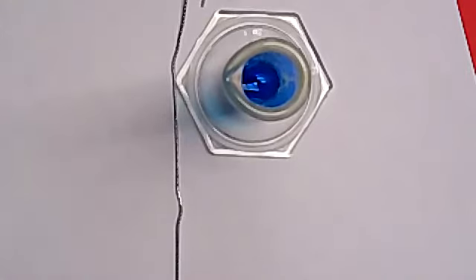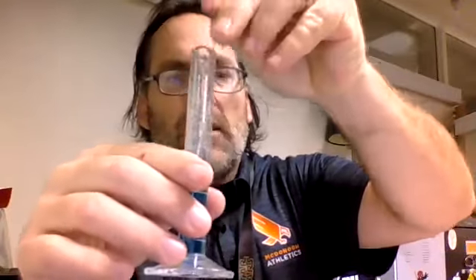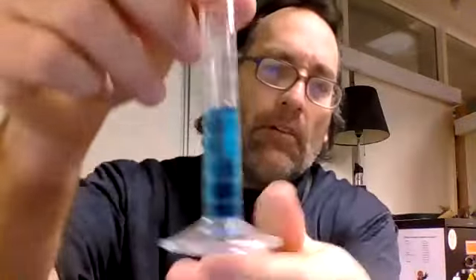So we're going to do this for 5 minutes in total. We're going to take our paperclip and add it to our copper sulfate solution, and once a minute we're going to make an observation of the paperclip that is in our solution. So we'll come back to this in 1 minute.